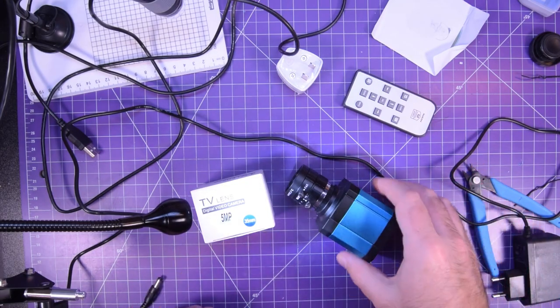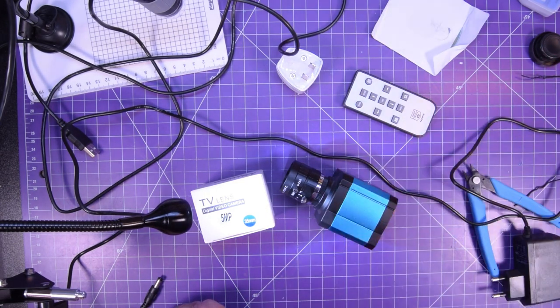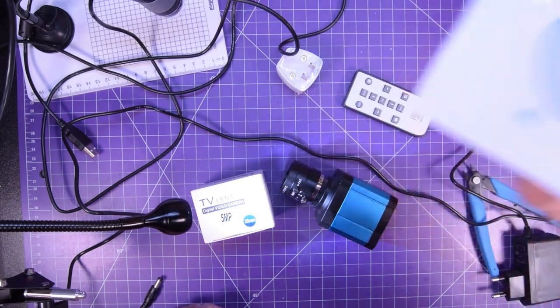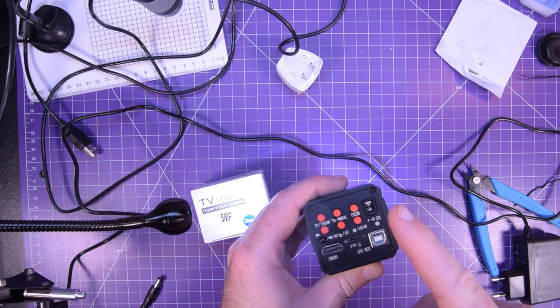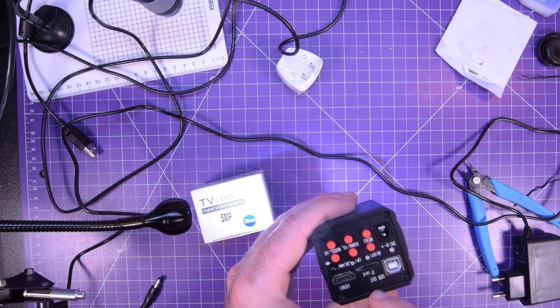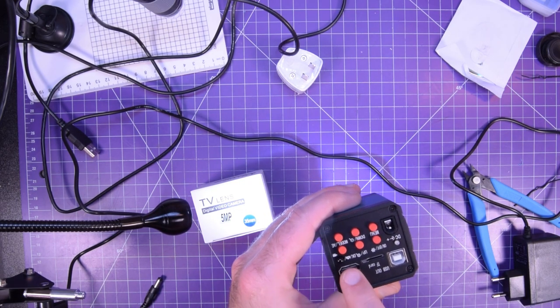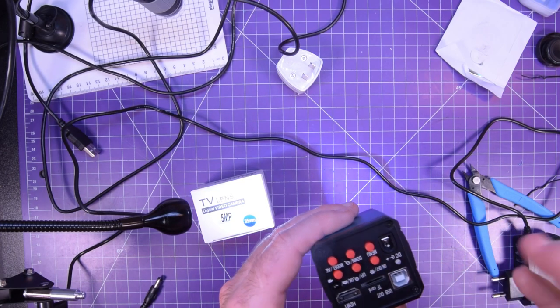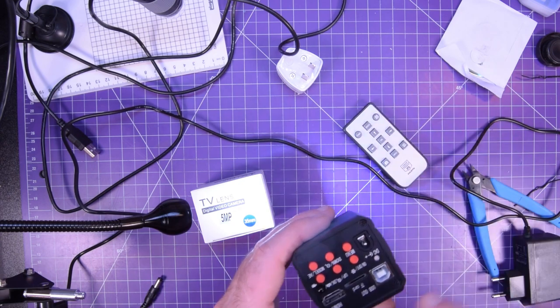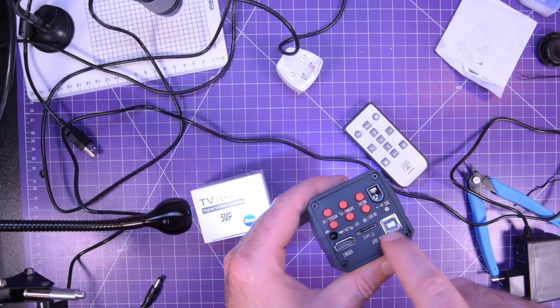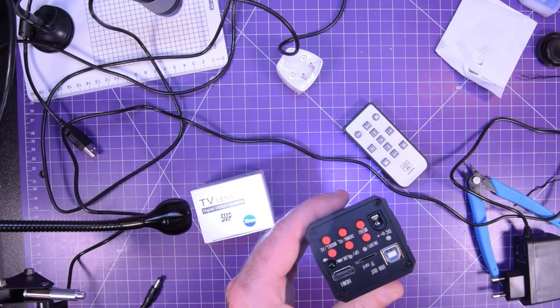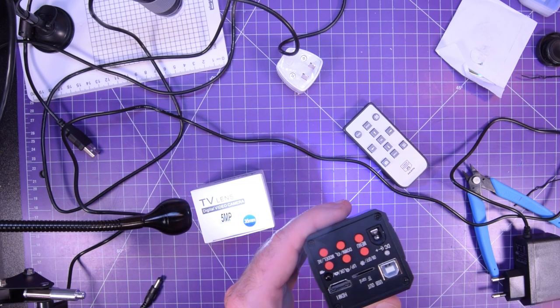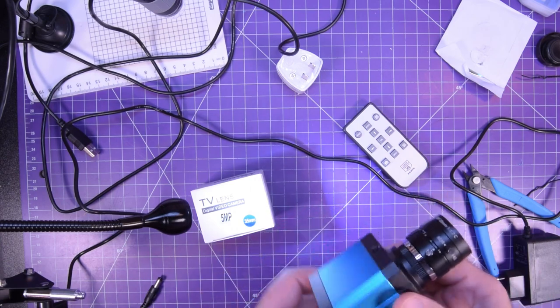I am hoping to maybe get a little HDMI screen here, hook this up to it, and I would hazard to say that this would be just fine to record YouTube videos on even. It's quite interesting. I might have to give that a shot and see what the files look like in the end. So I am actually pretty hyped about this thing. First of all, it installed in Windows 10 without any drivers, so I didn't need to plug this in. The remote control and the buttons on the back don't seem to do anything. So it probably does a screen overlay via the HDMI. So you really do have to get something plugged into the HDMI to work these buttons. But that's fine because then it's in standalone mode. It would have been nice to output over USB, though, because a lot of modern TVs have USB power. But yeah, you won't be able to see anything you're doing. Maybe you can. That's something I need to try for a different day.